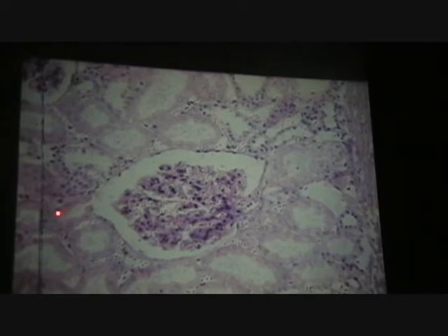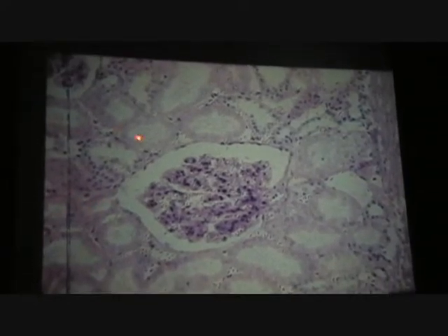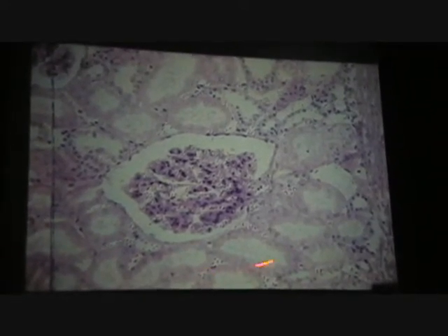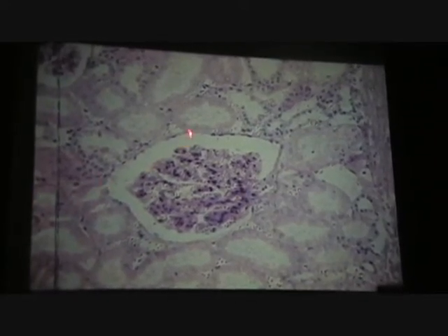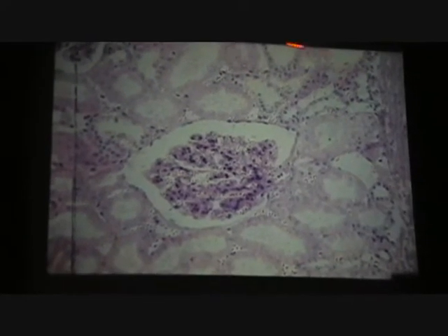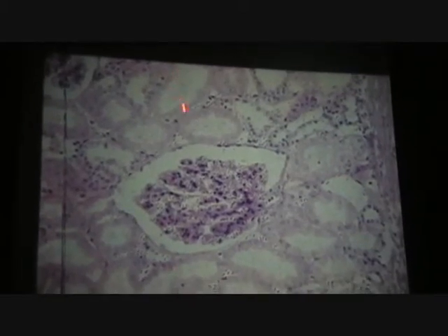And then off you go into the proximal tubule, where most of them you're now seeing in cross-section. It's too much to hope that you get one entire one in the same plane. So your biggest challenge here is to look at these tubules and tell which of the 3 types you are looking at.